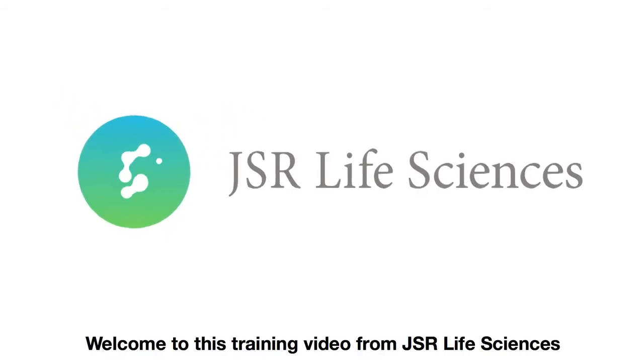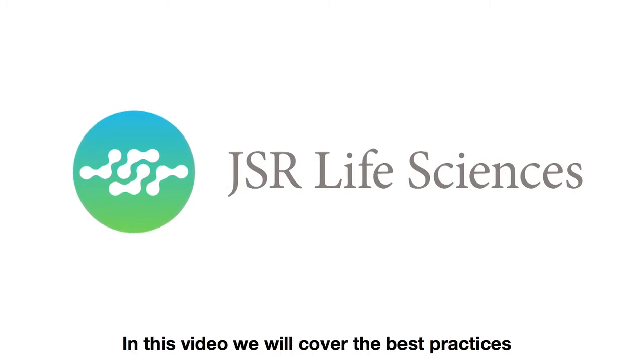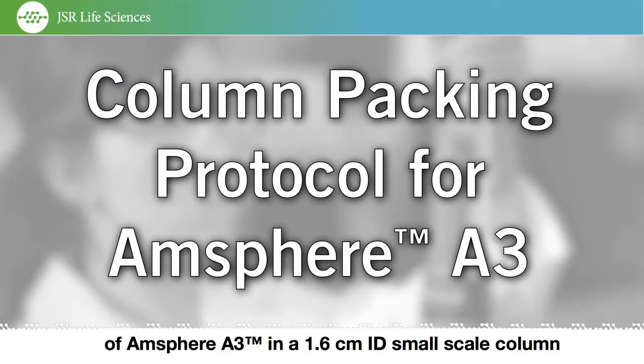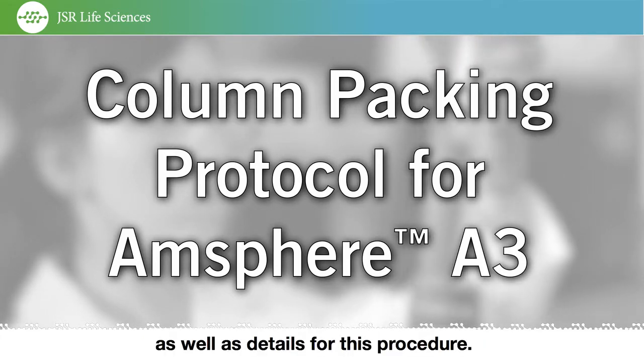Welcome to this training video from JSR Life Sciences' Separations Science Group. In this video, we will cover the best practices for column packing of AMSphere A3 in a 1.6 centimeter inner diameter small scale column, as well as details for this procedure.